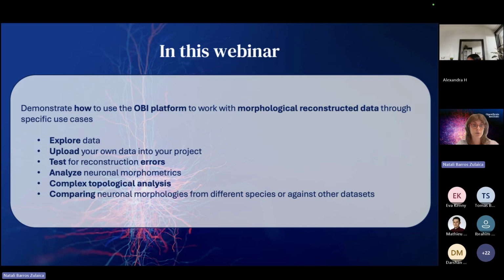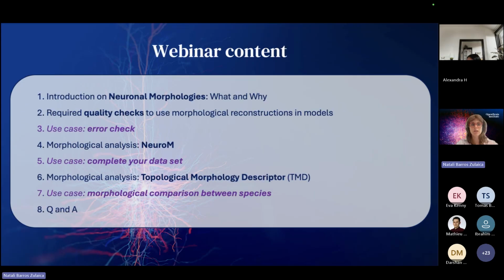I'm going to show you how to upload your own data, test your data for errors, and analyze the morphologies in 2 different ways, with common morphometrics and with a more complex topological analysis. And then I'm going to show you some comparative analysis between species. So this is the specific content of the webinar.